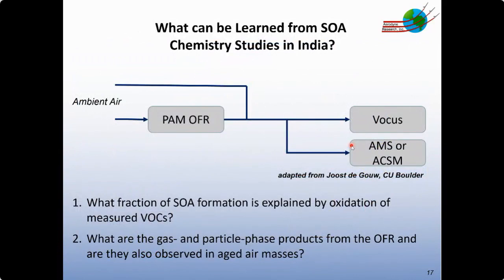So what are some of the ways that OFRs can be used to gain more insight into SOA chemistry in India? I adapted this slide from my colleague Joost de Gouw at CU Boulder, who was speaking in China a few years ago and was trying to motivate research studies that were centered around looking at the sources and the formation of SOA and the corresponding oxidation products through research collaborations in China. And I think a lot of the same questions hold true in India as well.